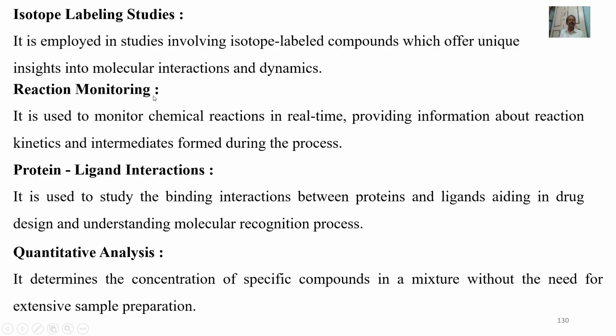Reaction monitoring. It is used to monitor chemical reactions in real time, providing information about reaction kinetics and intermediates formed during the process. Protein ligand interactions. It is used to study the binding interactions between the proteins and the ligands, aiding in drug design and understanding molecular recognition processes.